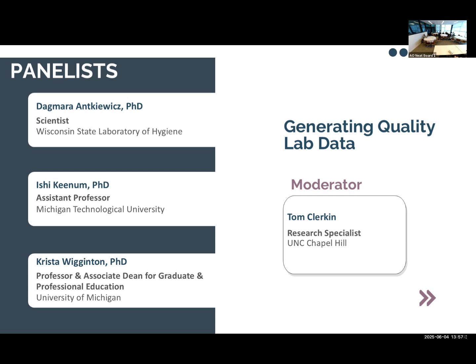Just things around that. Let's say you don't have to do it with every analysis. Maybe you only need to spot check your components in your process weekly or monthly, or there are ways you could implement something that you're more happy with. And something we haven't talked a lot about in this space, but which has anecdotally been a problem in my lab, and I've seen it across a few different labs now, so maybe it's a trend: wastewater processes are inherently variable.